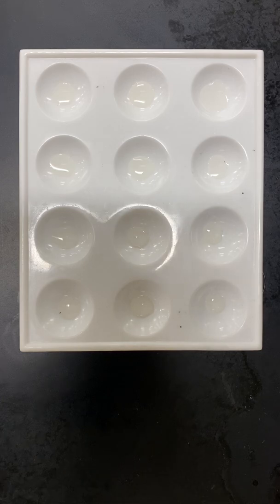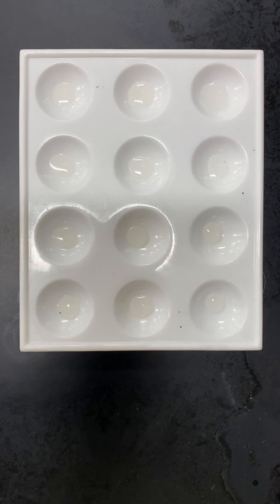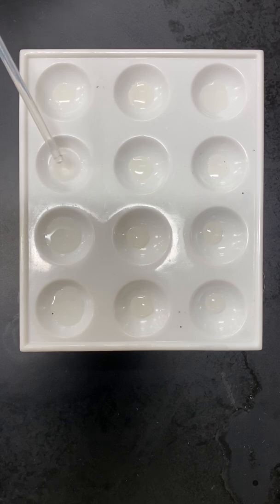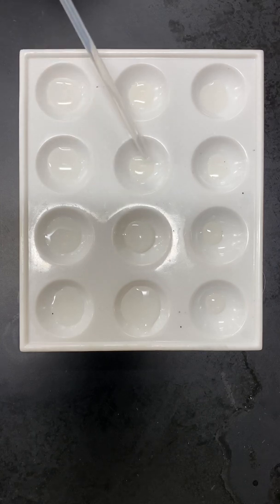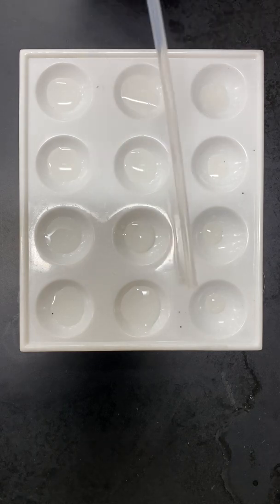And then the next thing I have to do is add 4 drops of deionized water to each of the wells. So that looks like this. Couple more.